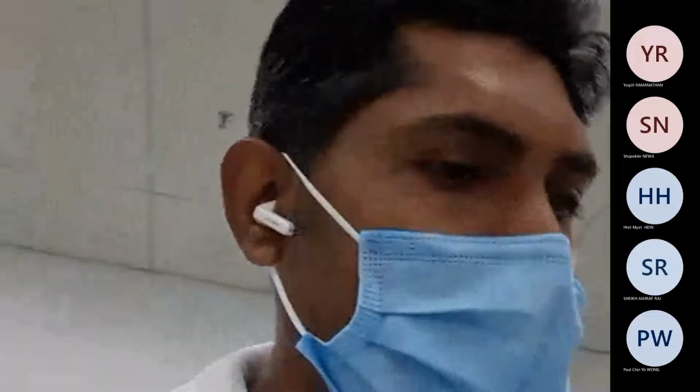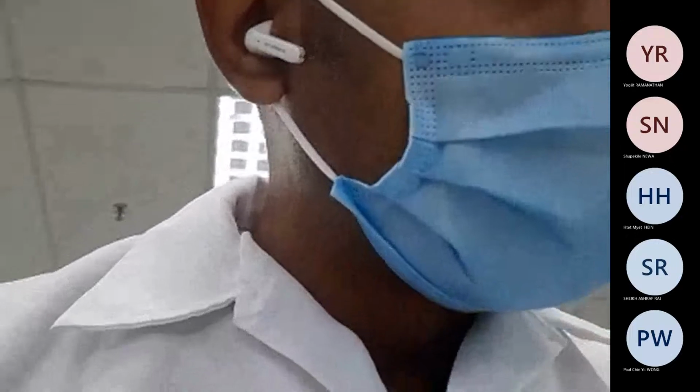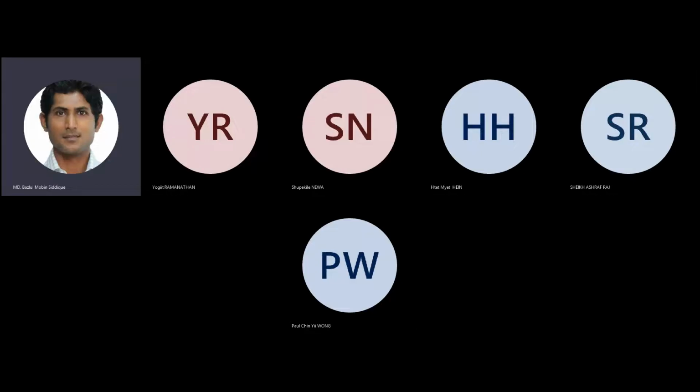Okay. So Beer-Lambert law, of course, you can find it from the tutorial as well. I think in the tutorial there are somewhere it will be the Beer-Lambert law. So you can find it, and then you can discuss as well. So before going to the Beer-Lambert law, this is the UV visible absorption spectroscopy meter, right? Students need to see that.